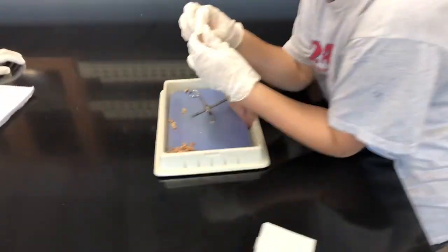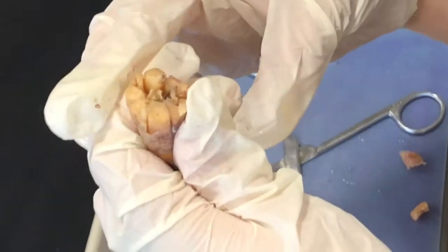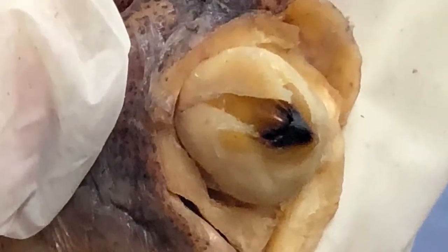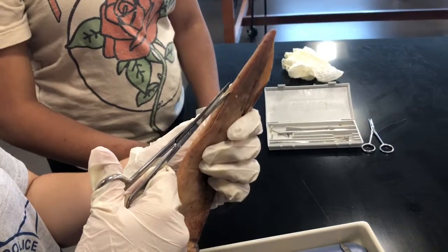As you can see here, this is a video of after Bree cut all the tentacles off because we were trying to find the radula. So it was fun and games until she grossed us out with the fact that all the tentacles that we just cut off were actually what we eat. Here is a picture of what we did afterward, and here's a picture of the beak after we ripped it out.